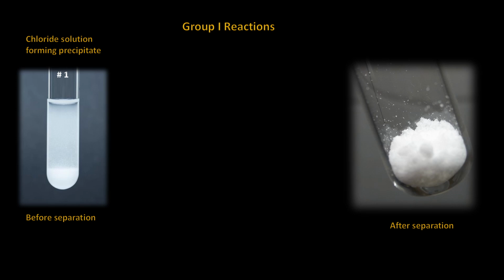The formation of precipitates and the dissolution of a compound is also determined by their KSP value. As discussed earlier, the larger the solubility product constant is, the more soluble the compound is. As shown, the solubility constant, KSP, for lead(II) chloride is quite high compared to the remaining and will dissolve in hot water. The remaining chlorides will remain as a residue.